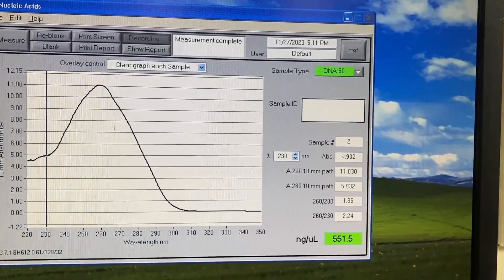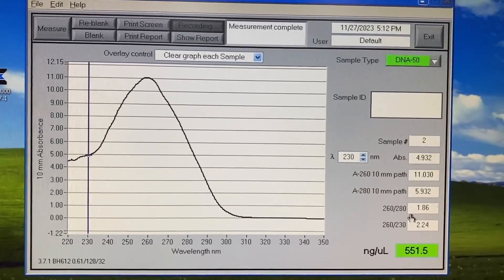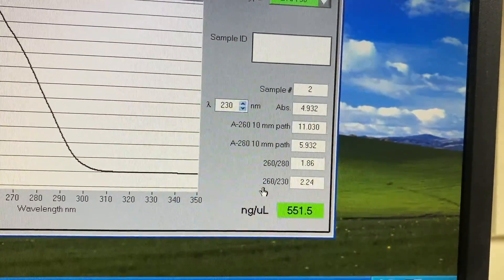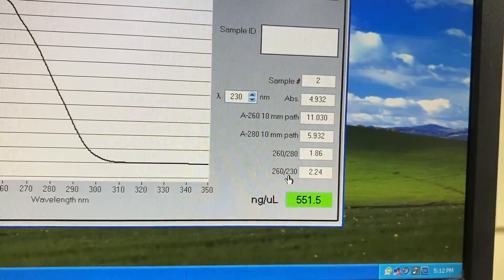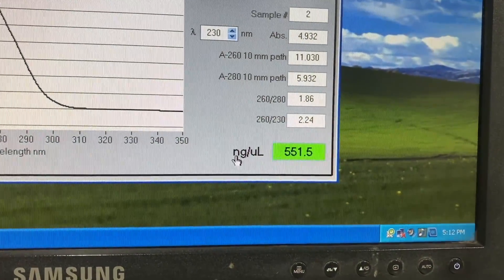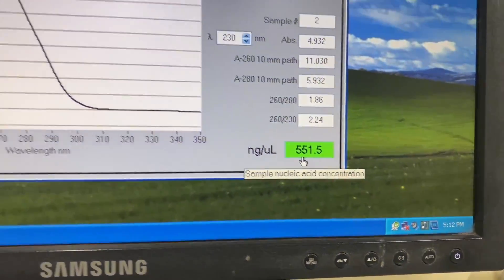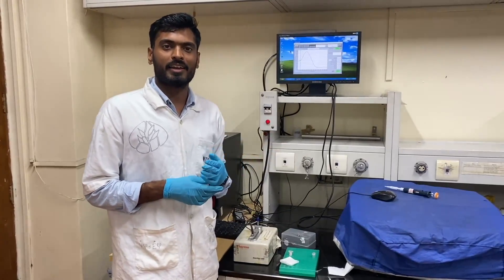Here you can see we have measured the concentration and purity of the DNA sample. The 260/280 ratio is 1.86, which indicates the purity of the DNA molecule. It also gives the 260/230 ratio, which mainly reflects the presence of organic solvents in the DNA. The concentration of our DNA sample is 551.5 nanograms per microliter. This is how you measure the concentration and purity of your DNA, RNA, and protein samples.